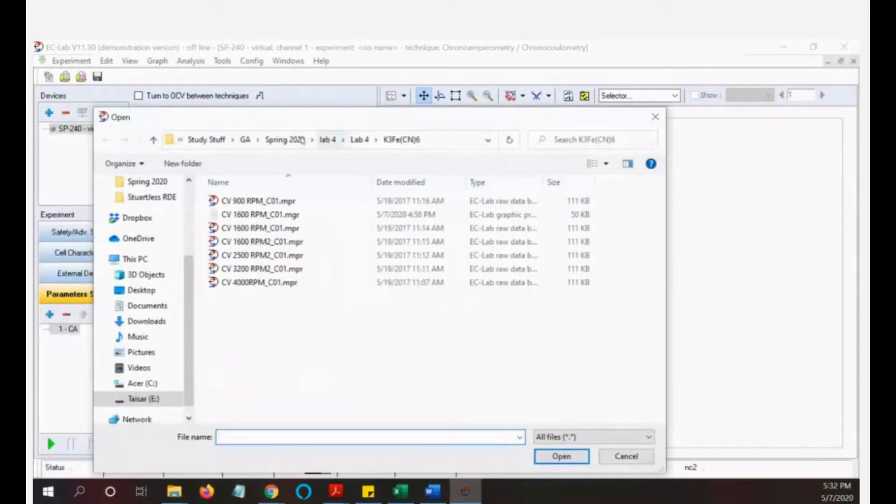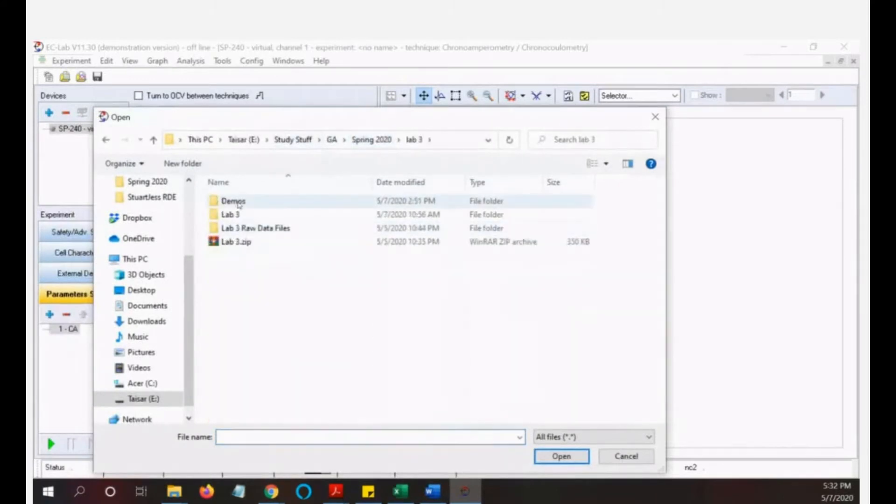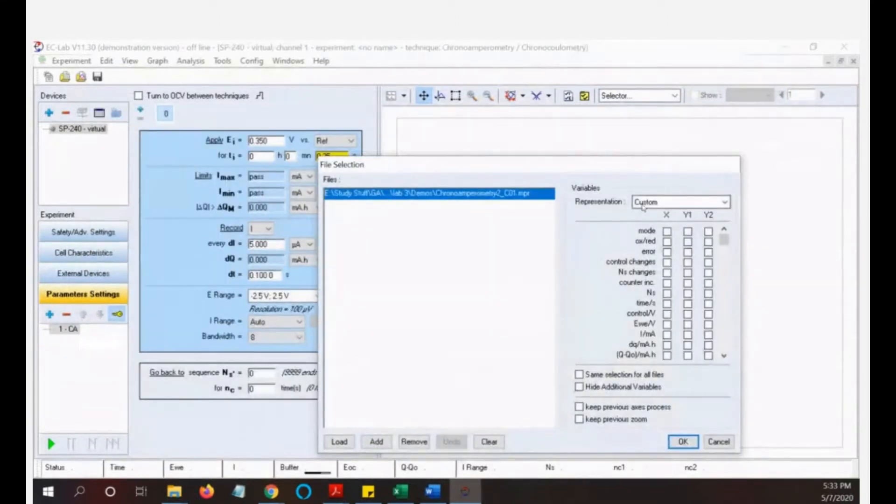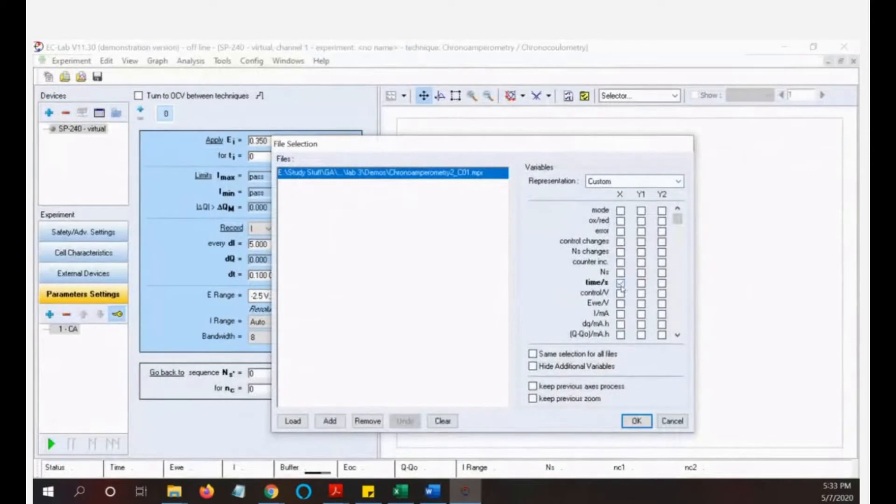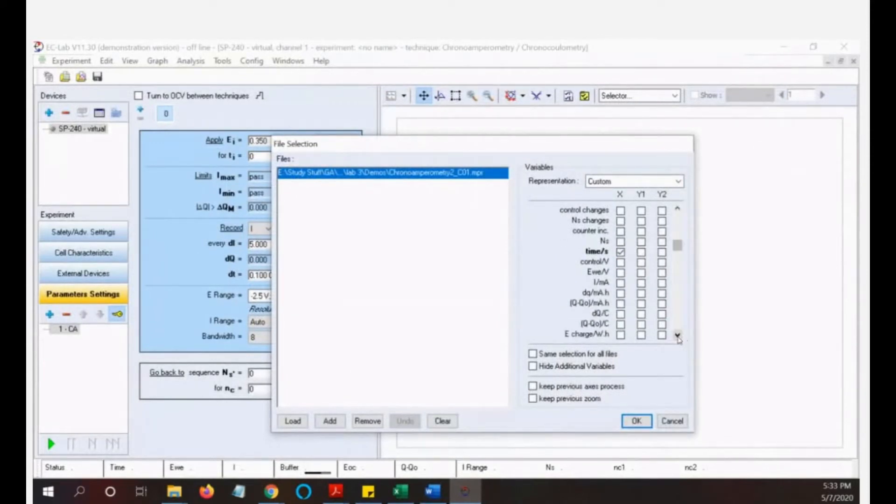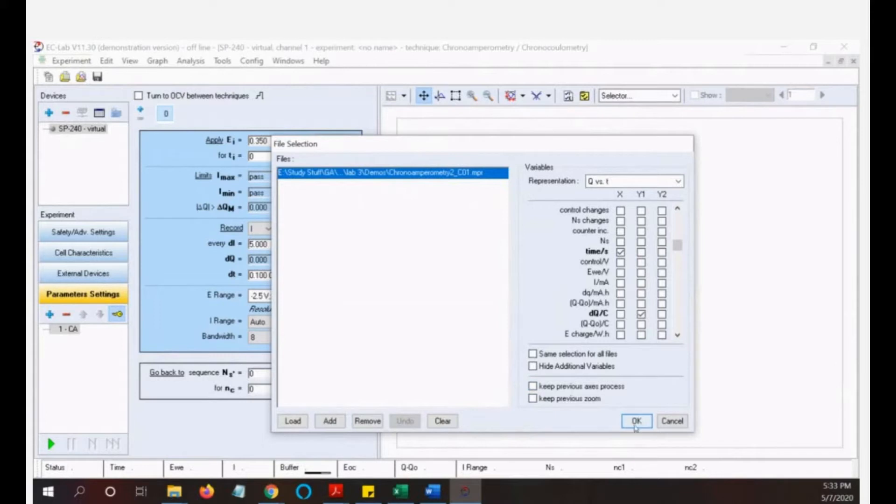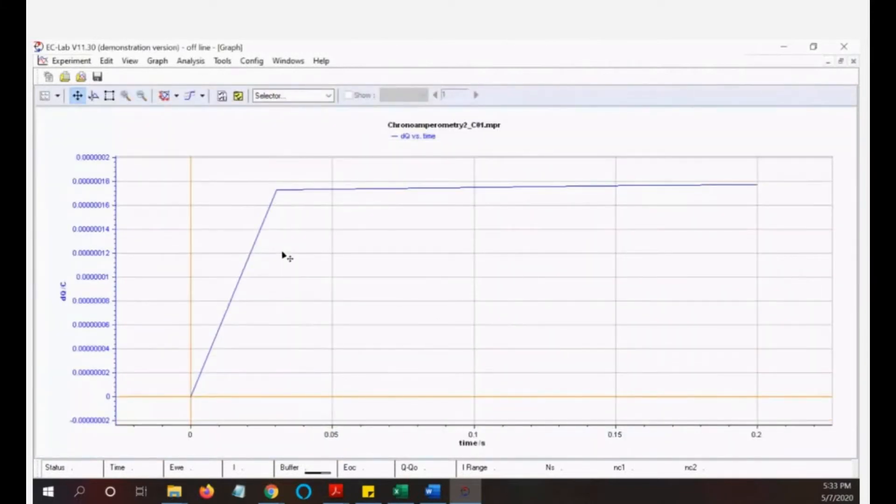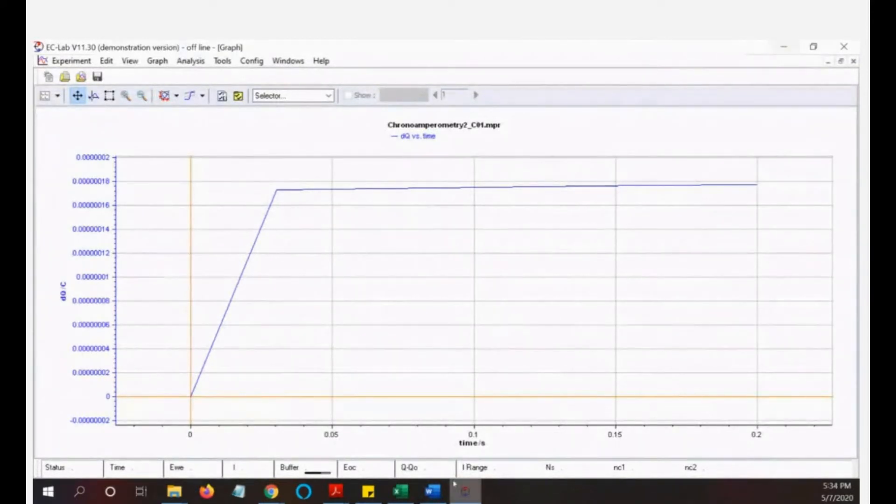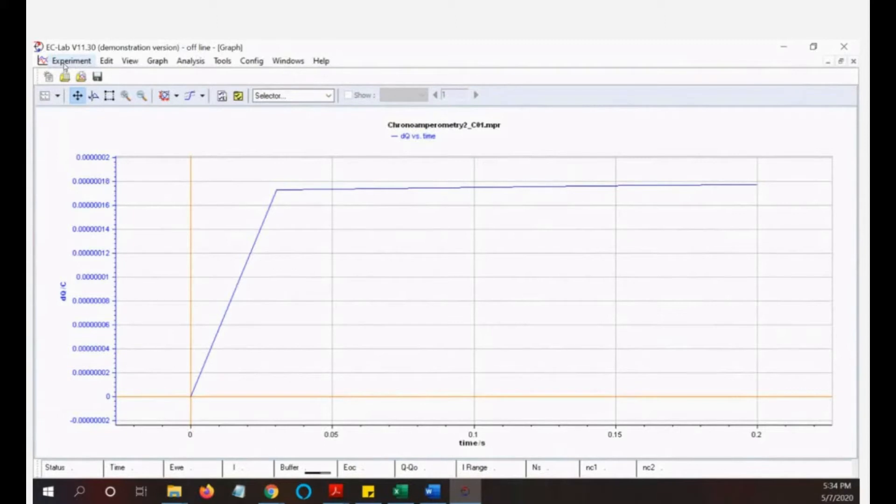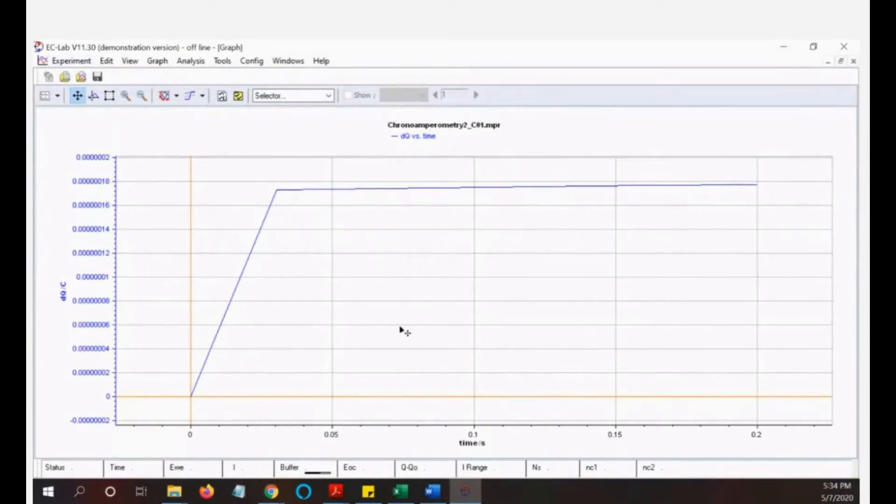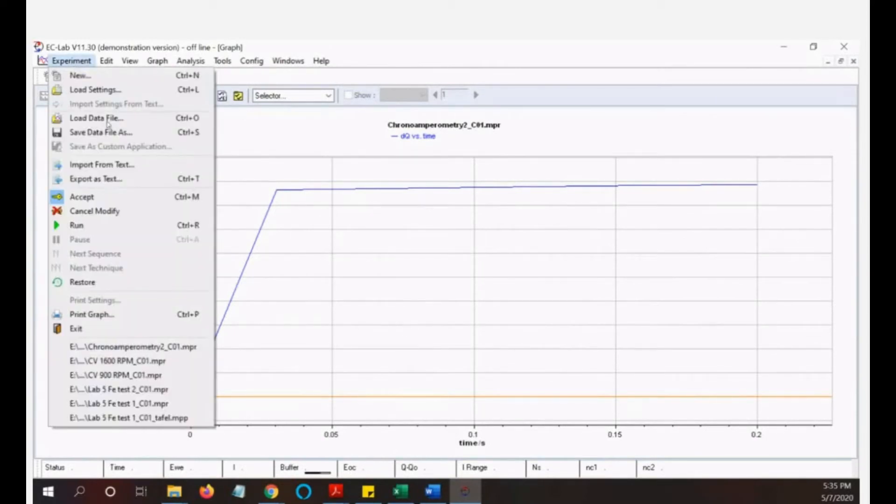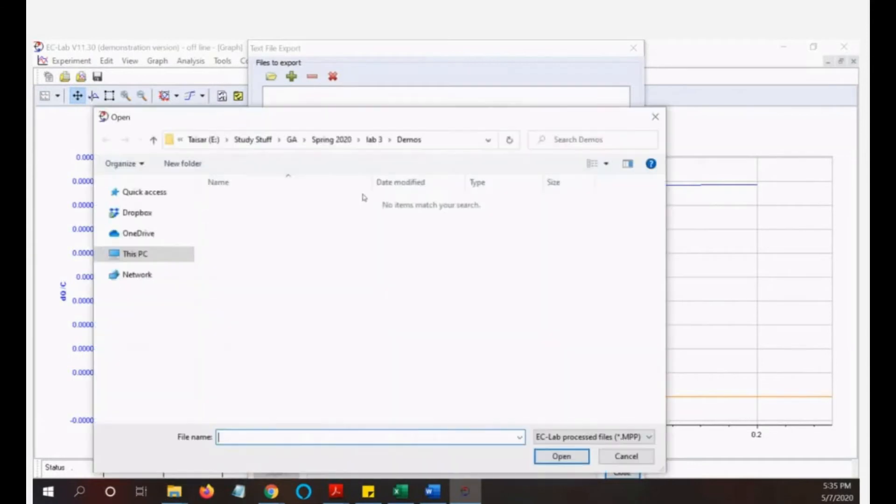After that you will have the data. I will load the data. So this is the chronoamperometry result. This is time as the x-axis and then the y-axis is the charge. Click OK, so this is how that graph looks. You need to export that in Excel because we cannot have those tools in here to plot. Export this result to text so you can open it with Excel and you can make the formula.